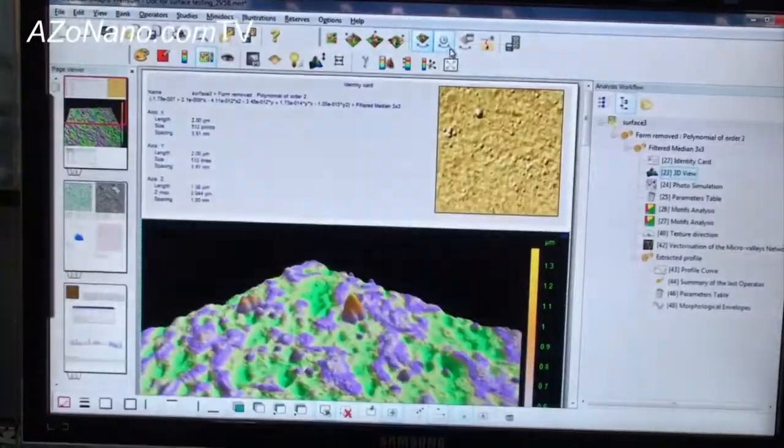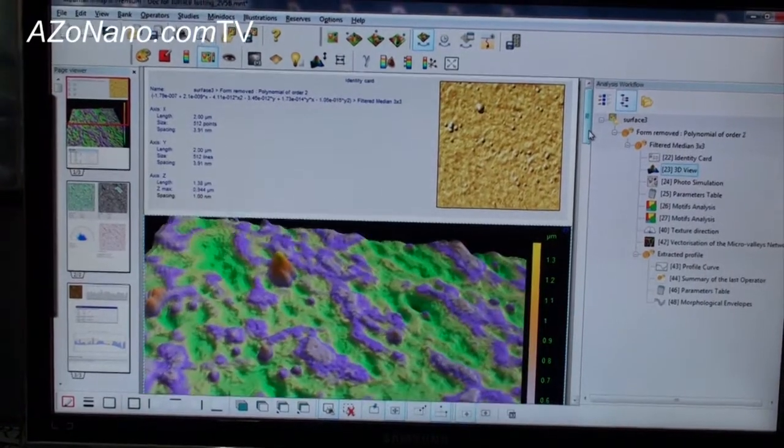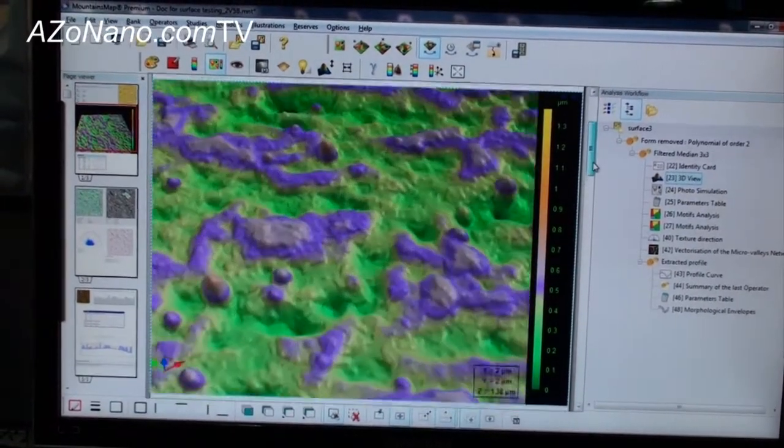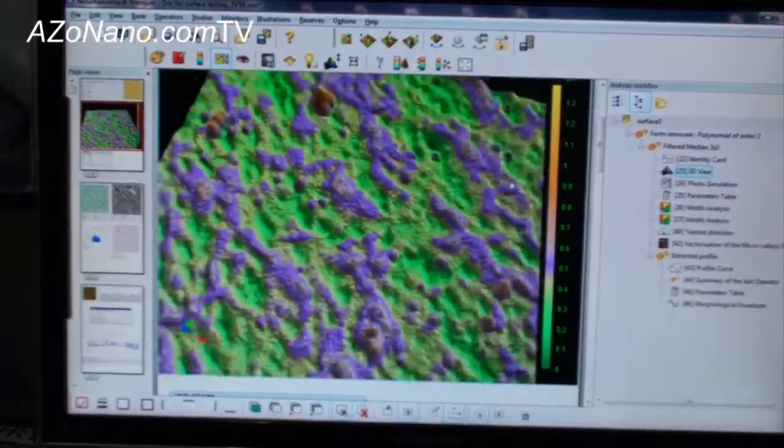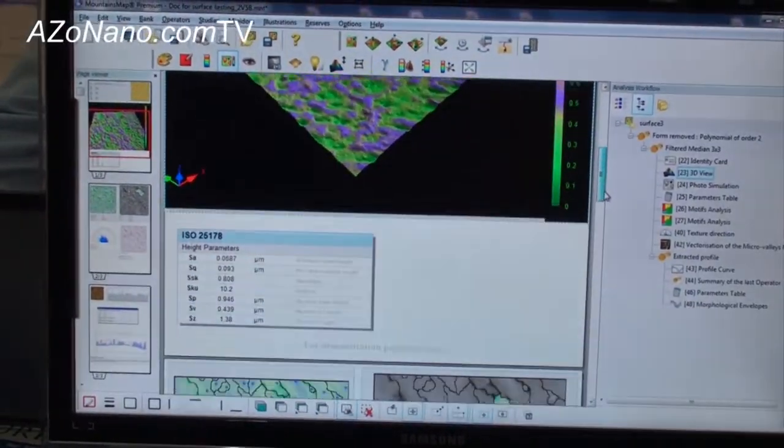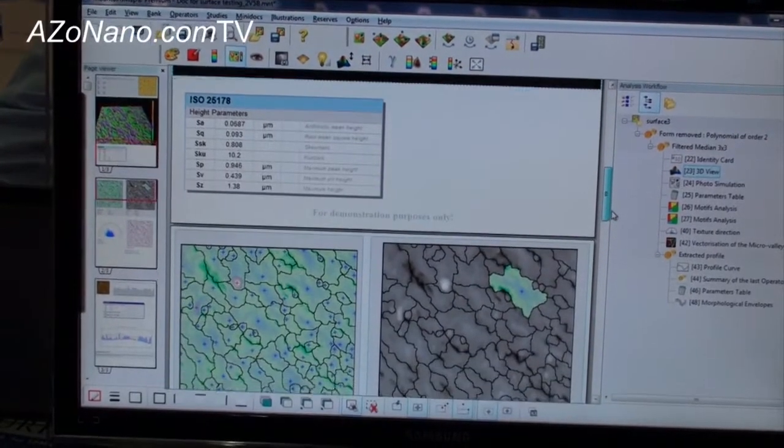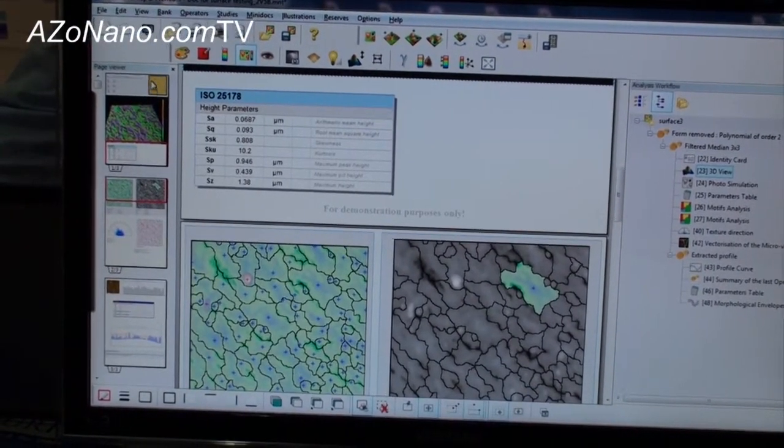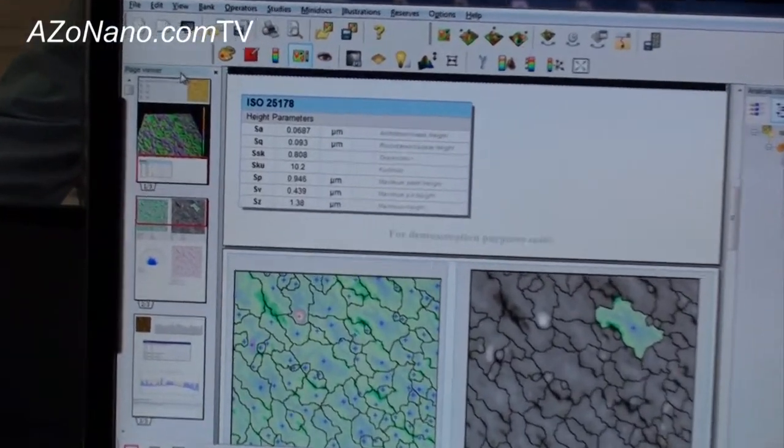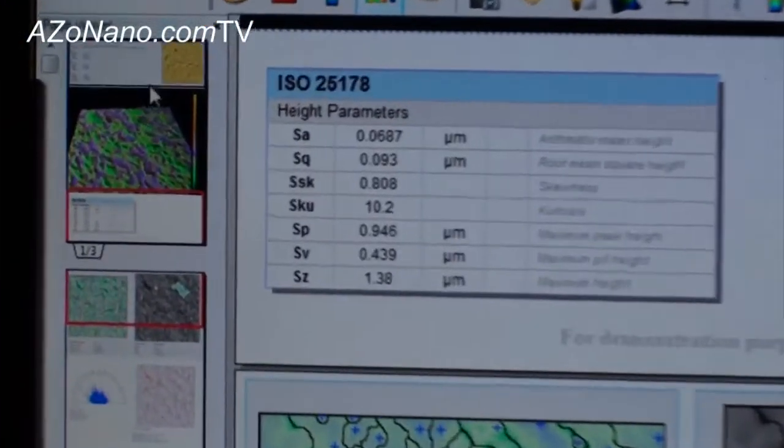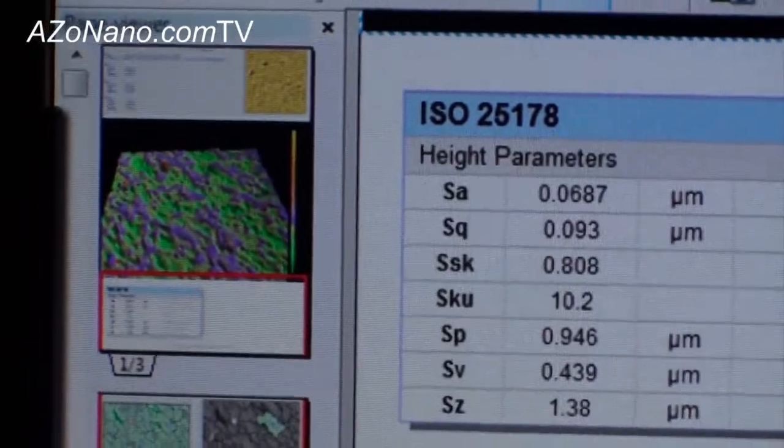First of all, I'd like to show you the document which is a series of information. On the left side of the document of the user interface, you have a page viewer containing the three pages of information.